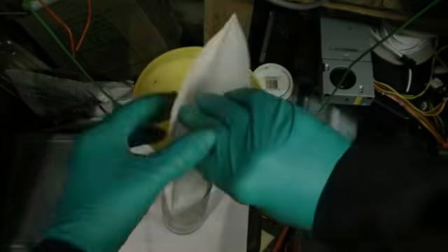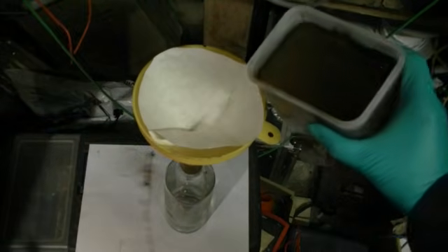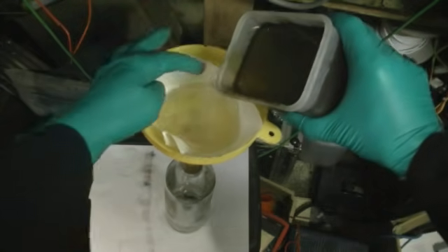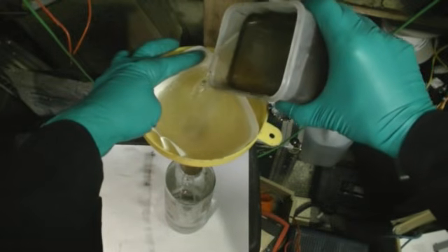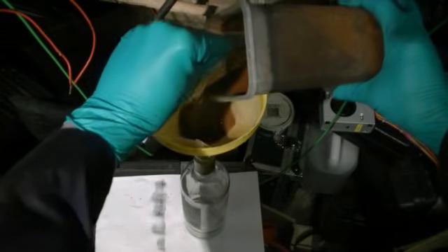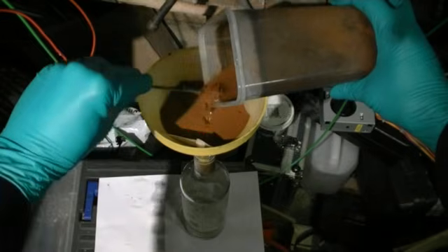Next, using a coffee filter paper, the solution is filtered. Taking care not to disturb the settled sediment, the liquid electrolyte is easily filtered off. Then, using a stainless steel spoon or spatula, it's quite easy to scoop out the product from the bottom of the container into the filter.